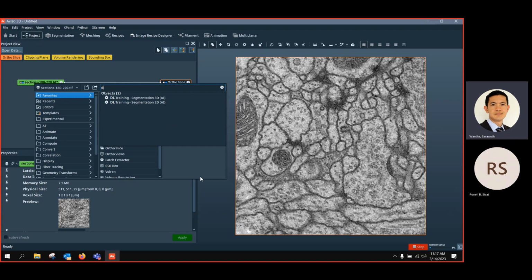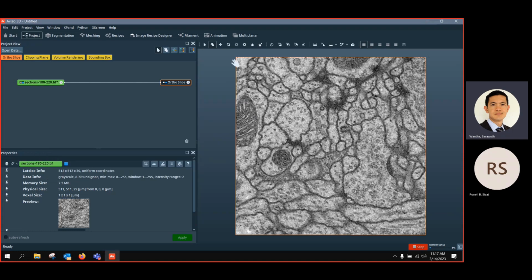And yes, as the name suggests, when we do this training with 2D, it will create patches. For example, you have created a patch of 3 by 3 pixels. This patch will go through all the images that you are setting, and then it integrates with the CNN, convolutional neural network, and then goes to this layer to compute the deep learning training to generate the model, the architecture model of the training. But we can go into more detail later.